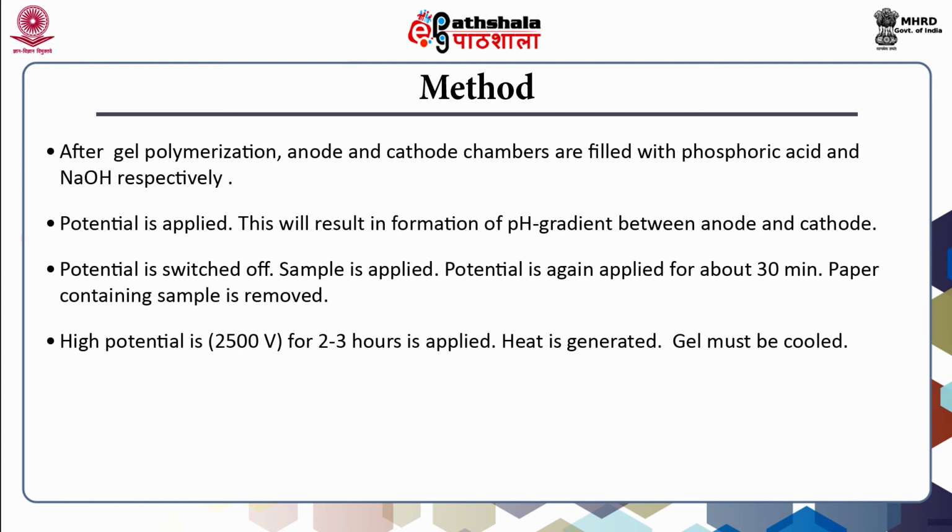High potential is required for isoelectric focusing, and a voltage of 2500 volts can be applied. As a consequence, considerable heat is generated. Thus, the gel must be cooled to 10 degrees centigrade to avoid band diffusion.